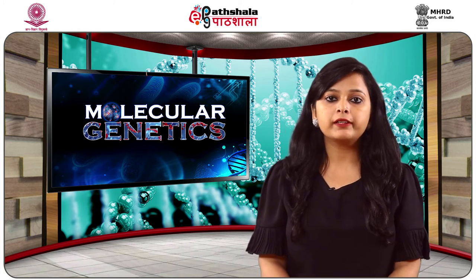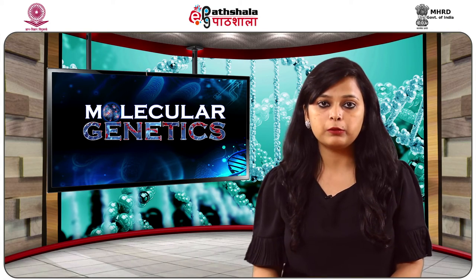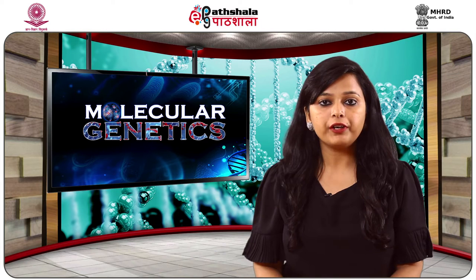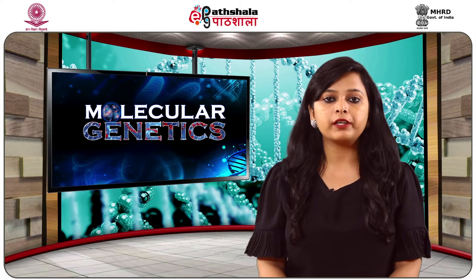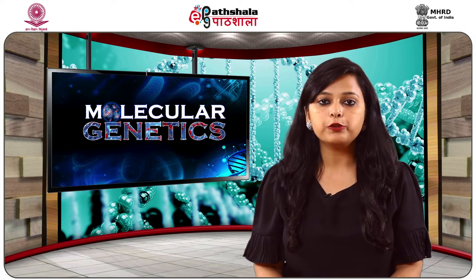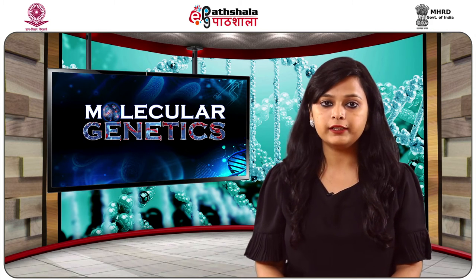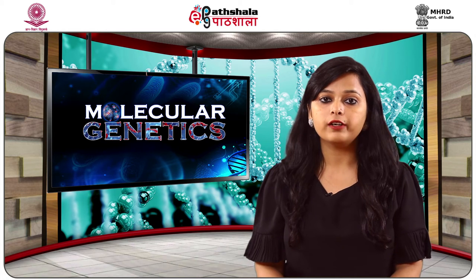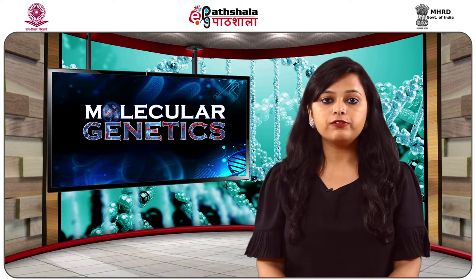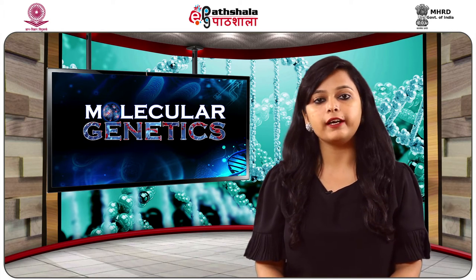Let's talk about methods of probe labeling, that is, how we can label the probe. First is radioactive detection. For years, the probes used in blotting techniques were radioactively labeled with P32 due to its high energy and efficient integration into the phosphate groups of different deoxynucleotides. The detection of these radioactively labeled probes is done using X-ray film.